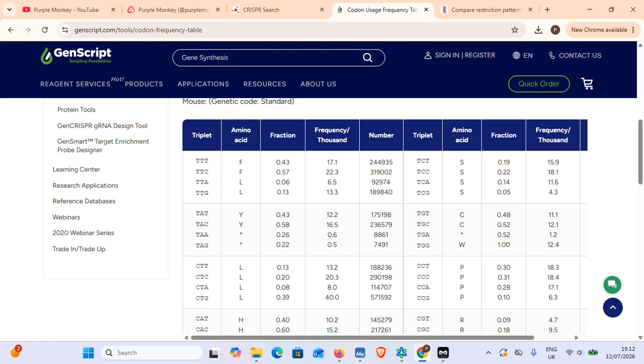So we were at TTG, but CTG, you get a 2 for 1, as well as being the number 1 codon.